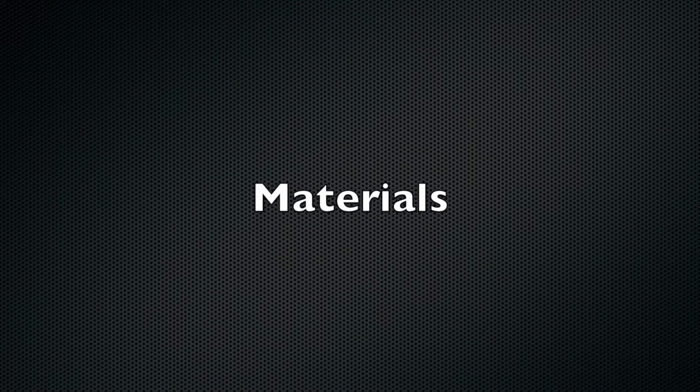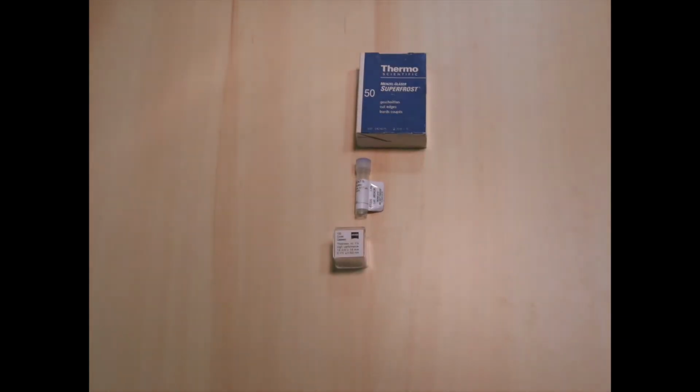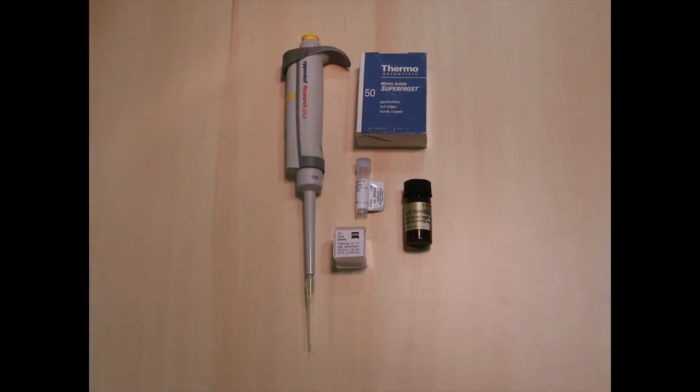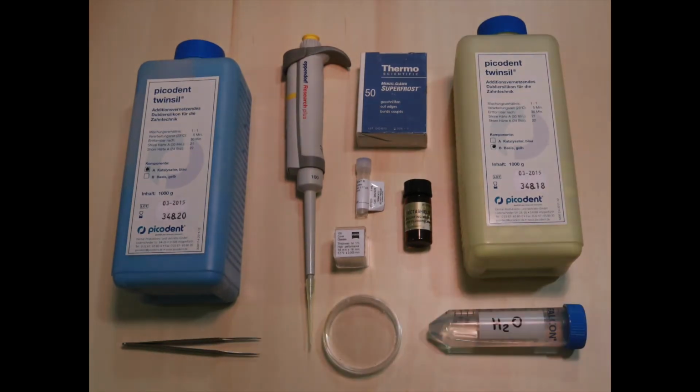To prepare the sample, we are going to use the following items: fluorescent beads of different size depending on the microscope objective, a slide and a 1.5 type cover slide, a pipette, 5 to 10 microliters of mounting medium, 5 milliliters of dental silicone, we really prefer it to nail polish, with a petri dish, forceps, and some milliliters of distilled water.